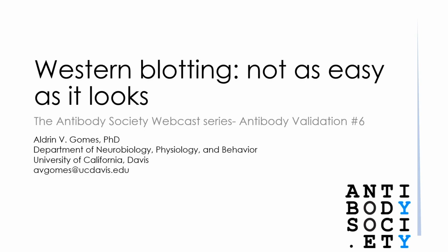I think this is really an excellent example that shows that even very common validation technologies can be more challenging than they appear at first attempt. I'm particularly fascinated by the different non-linearities in the technique. It's fascinating that the housekeeping proteins, of course, somehow we know that they're differentially regulated, but to see it so dramatically is fascinating. And also in the detection technologies, people tend to forget that there's a cutoff, or that the software might not be linear or is cutting out parts of the signal. I think it's a real challenge, and people have to be aware of these things. And I think your talk really highlighted that.